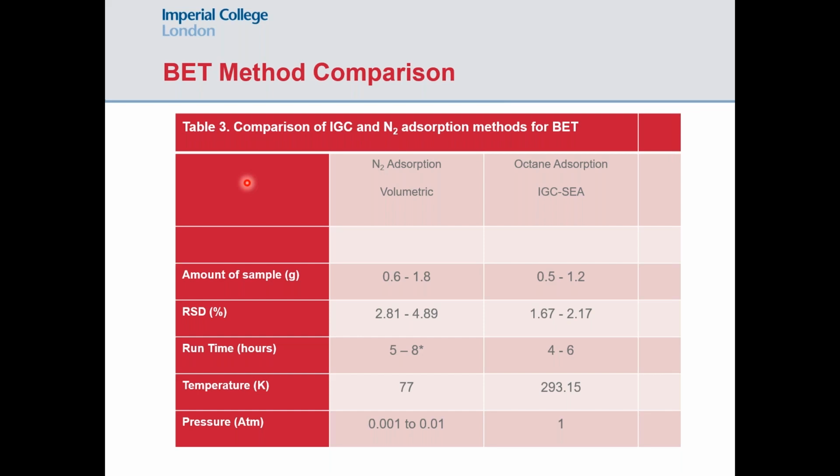The temperature is quite different because we're doing our temperatures at room temperature, not at 77 Kelvin. And the experiments are not done at the vacuum, they're all done at atmospheric pressure. So there's a few small differences there.